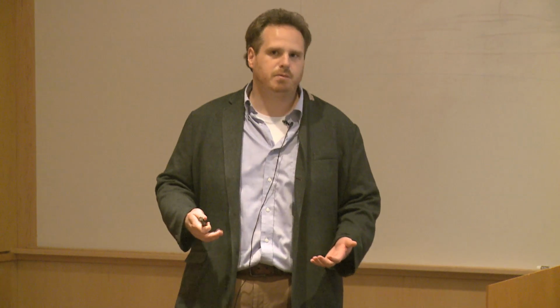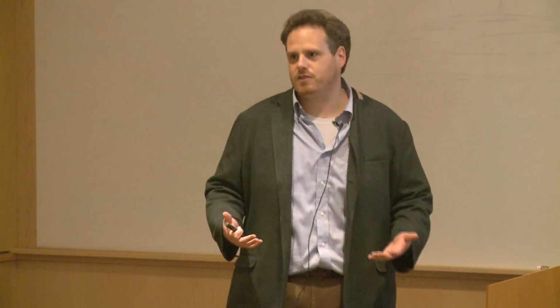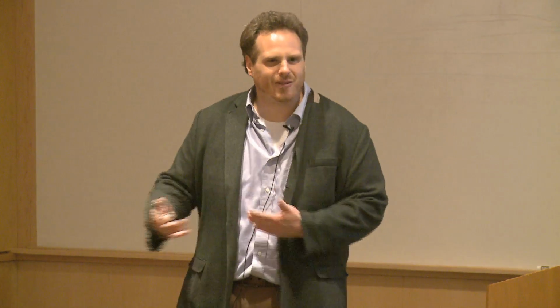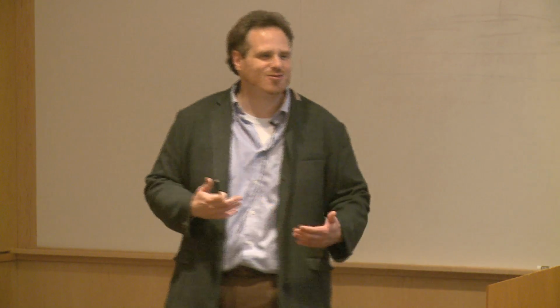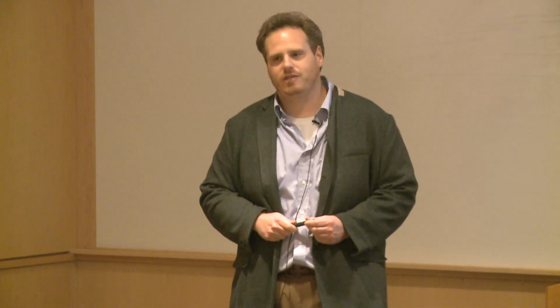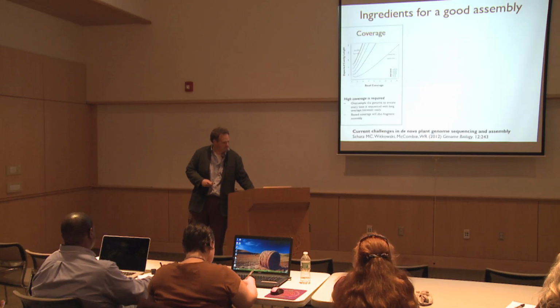But in those projects, we've described some metrics that can be used to try to say, yep, this looks good, this looks bad. Size in itself is not a great indicator, right? You can trivially smash things together if you want big size. So you have to be a little bit cautious over just saying, oh, my contigs are this big or that big. That is not necessarily a good indicator.